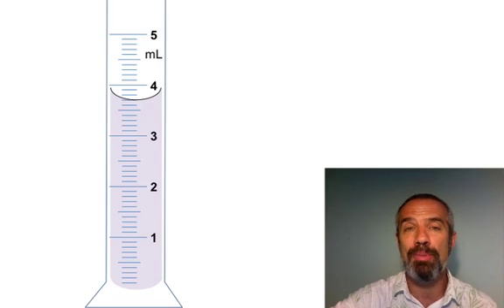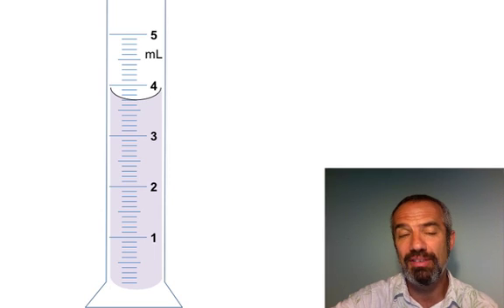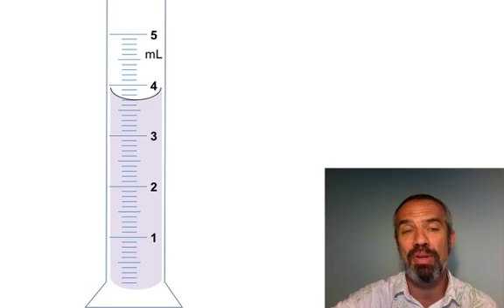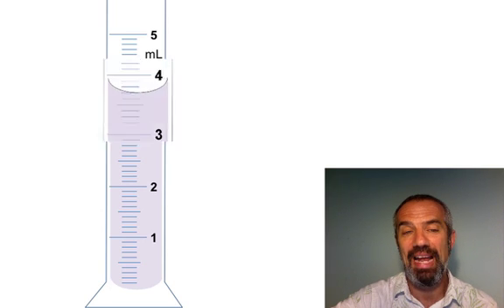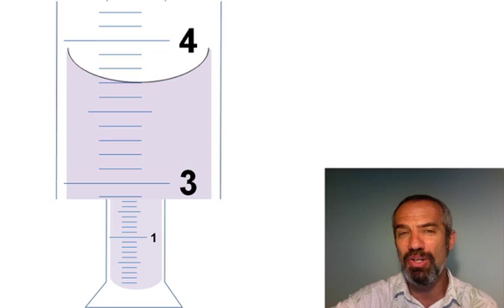How about this liquid? Notice now I'm using a smaller cylinder and zoomed in on it. So this is one, two, three, four, five milliliters. And when I zoom in on it, it looks like it's right on the mark.